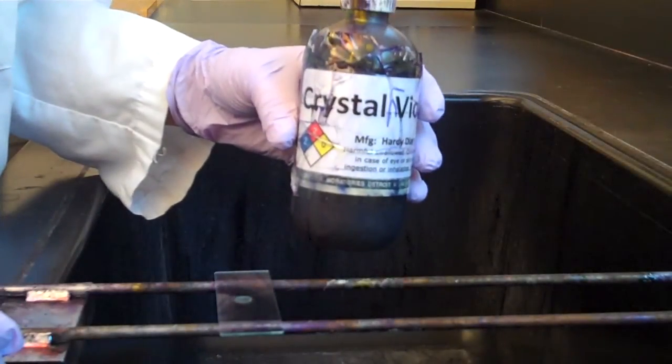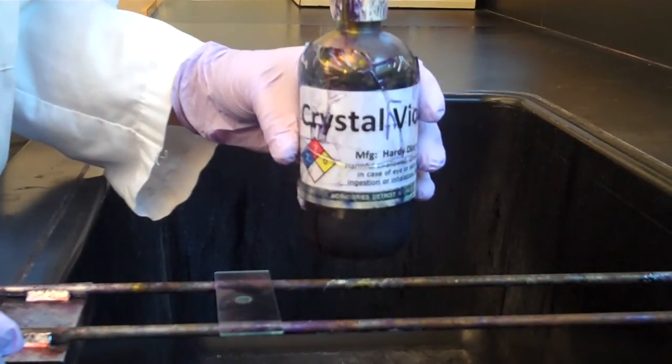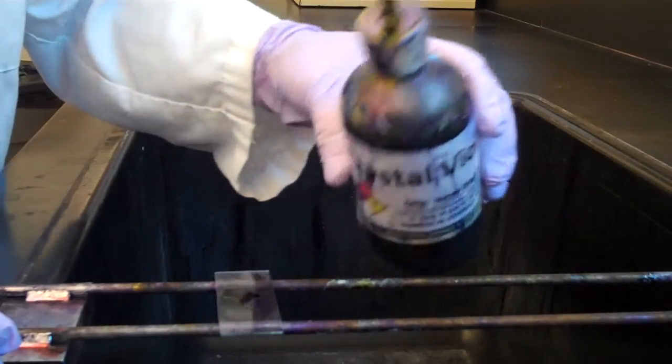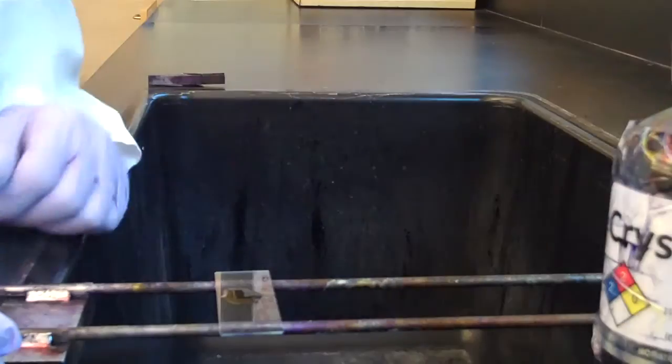Today we're going to demonstrate the Gram stain. Begin the Gram stain by puddling crystal violet just on top of the smear. Wait one minute.